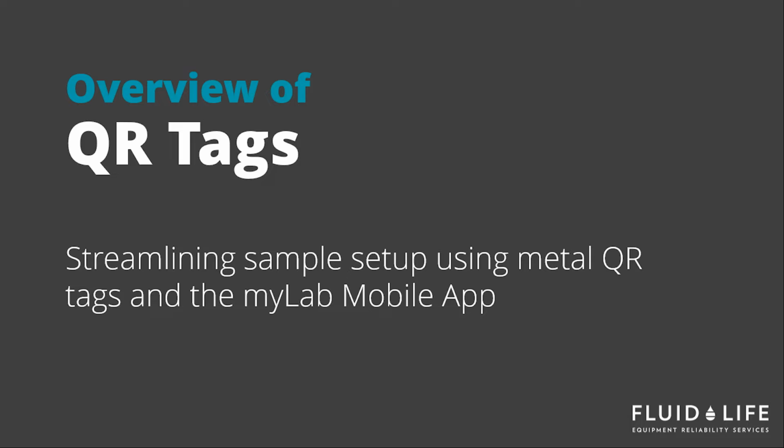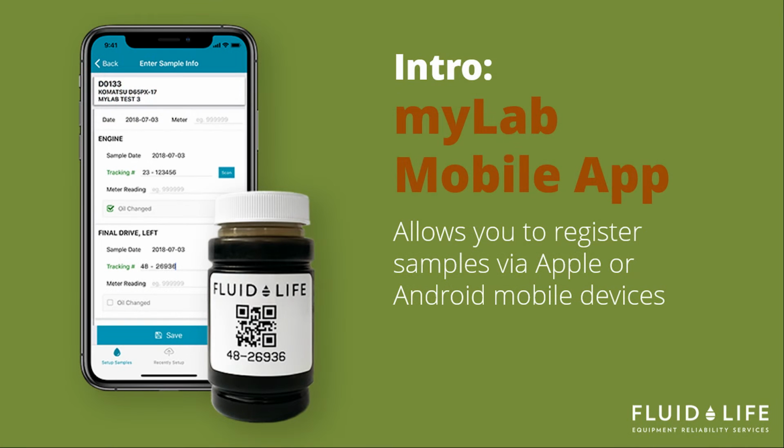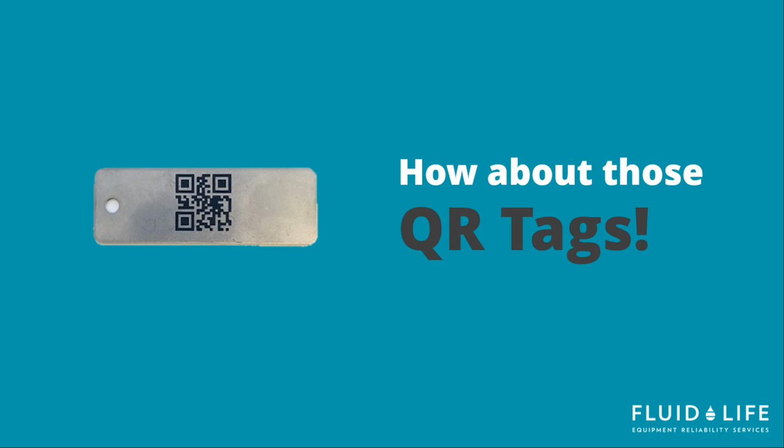And today, I'd like to talk to you about streamlining your oil analysis setup process using FluidLife's metal QR tags through the FluidLife MyLab app. The MyLab app allows you to access MyLab on your smartphone or other smart device, both online and even without cell reception. So let's talk about these tags.